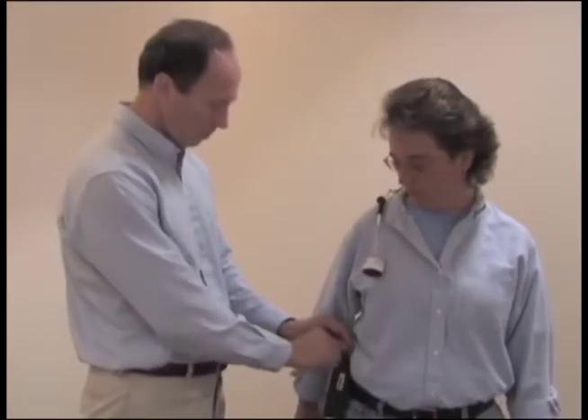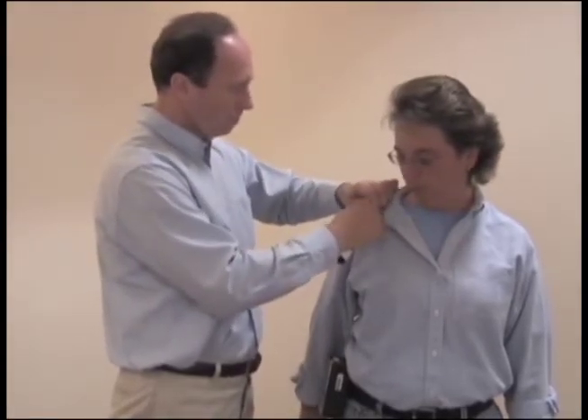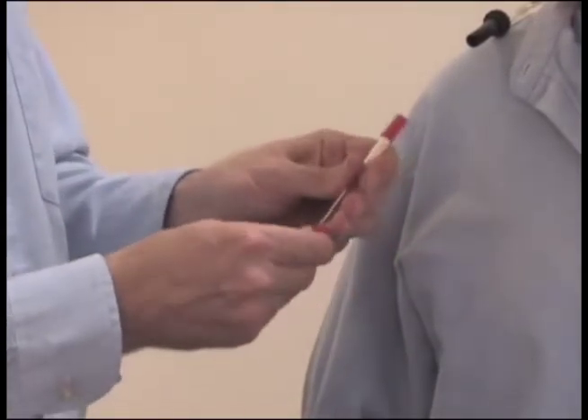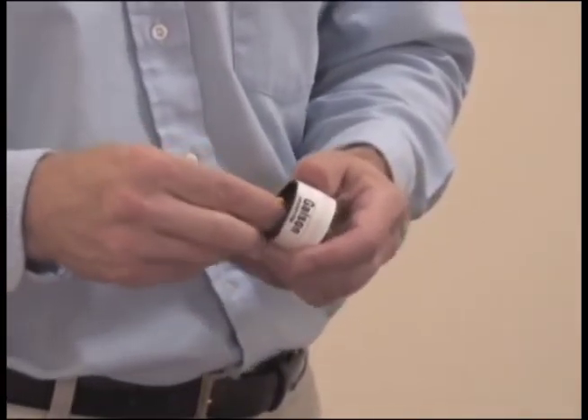After sampling is completed, turn off the pump, remove the sorbent tube and immediately seal both ends with the red caps provided. Remove the tubing with lure adapter and install nibs on both ends of the cassette.